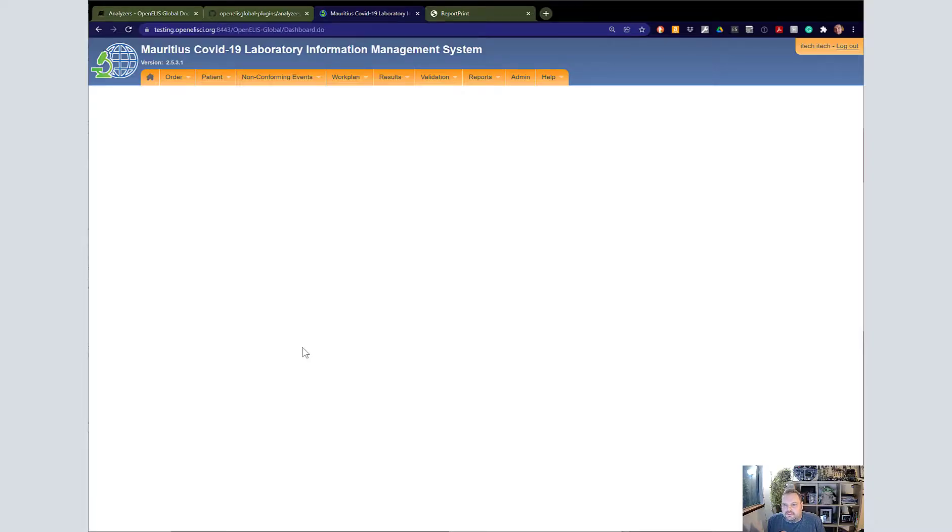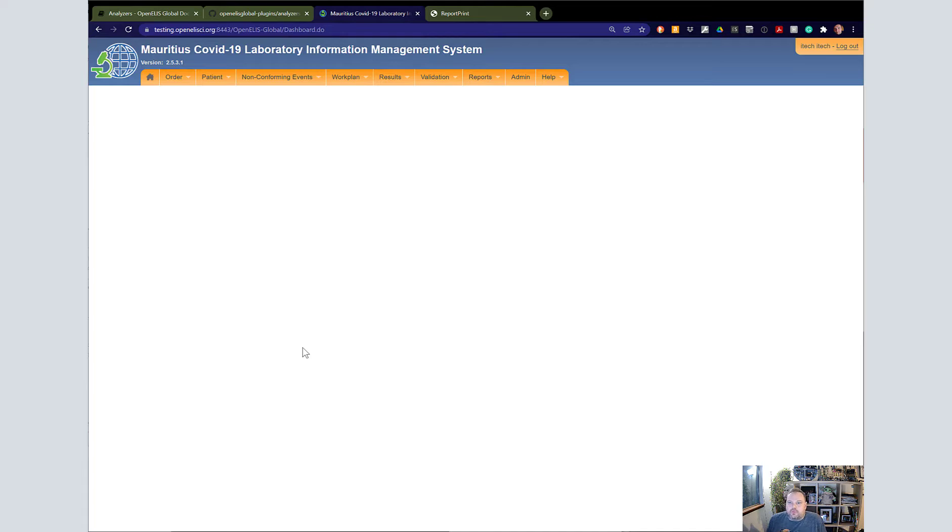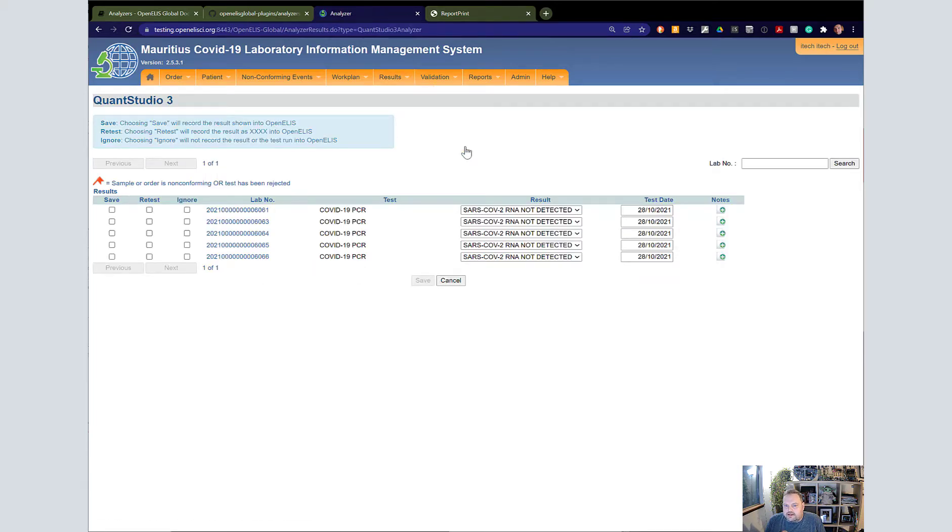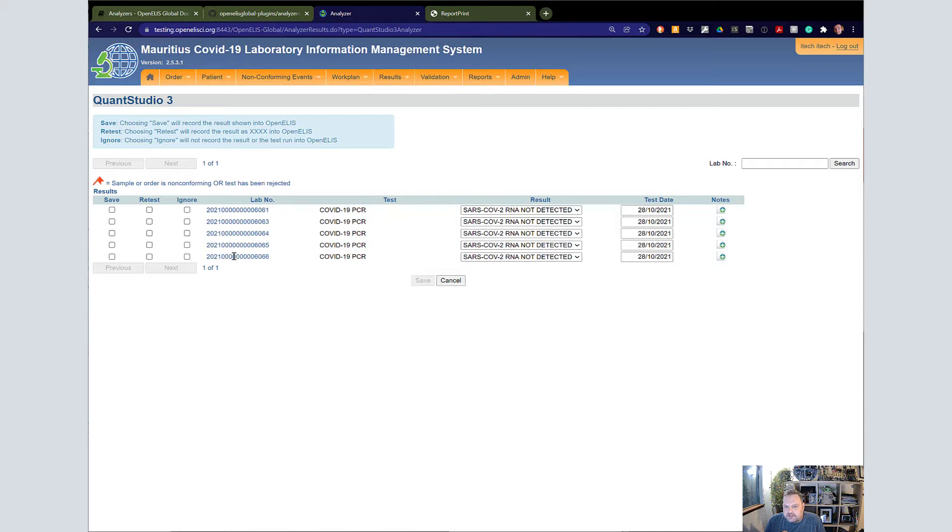Finally, we'll go back to OpenAlice and see the results imported into the system. We can log in, go up here to Results, go to Analyzer, select the QuantStudio 3 Analyzer. I had previously imported this result, which has a few more than just our one test, but here it is. You can see the test and the results.